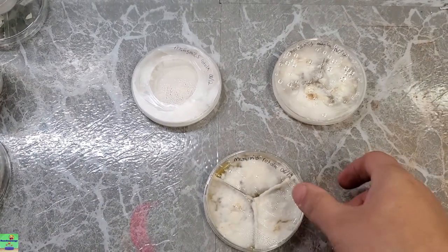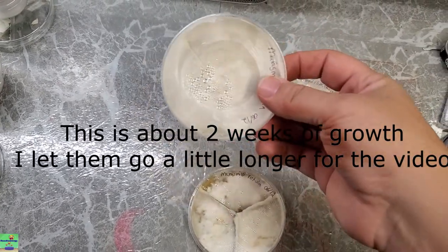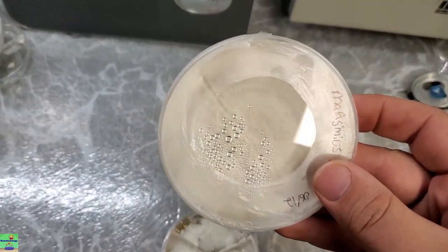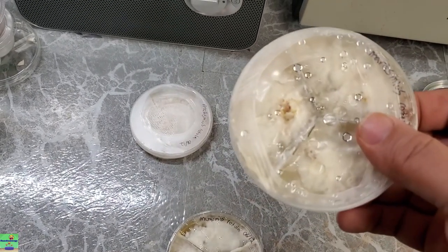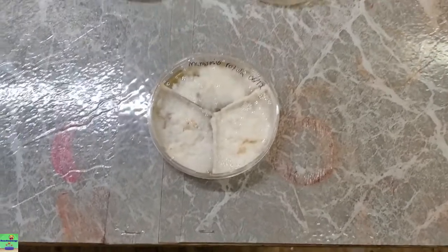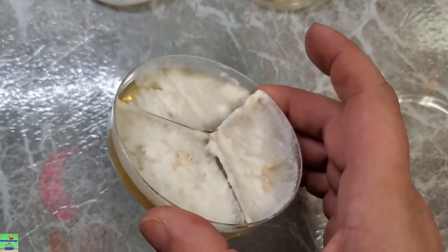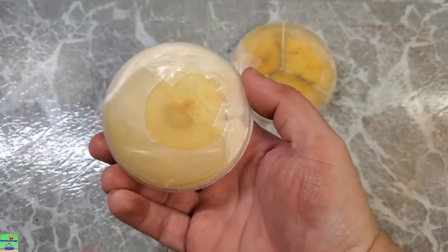Okay, and a quick update to show what the mycelium for pinwheel mushrooms looks like. I did take the parafilm off of this one so I can get a better shot. But you can see these grew really, really well. They are completely colonized. These are the mycelial growth of pinwheel mushrooms, Marasmius rotula.